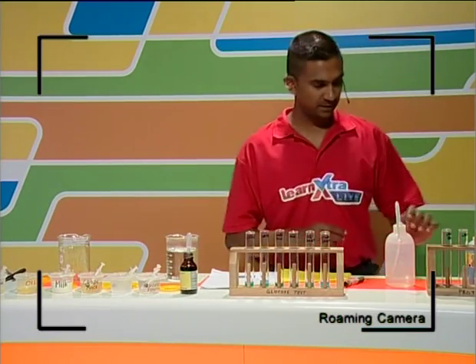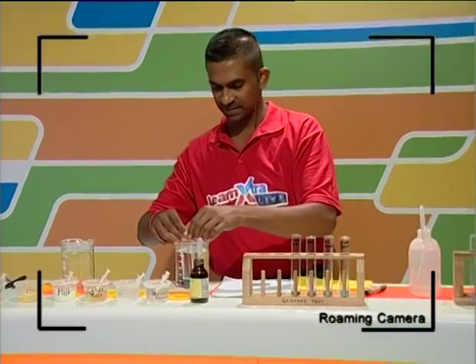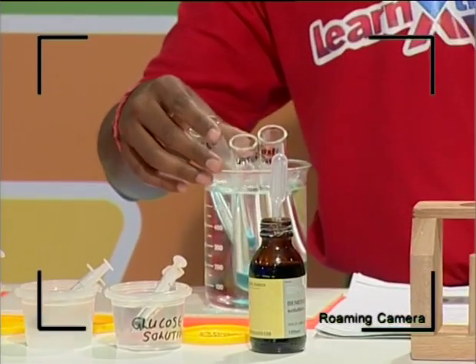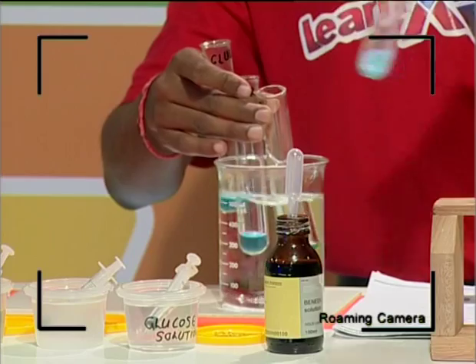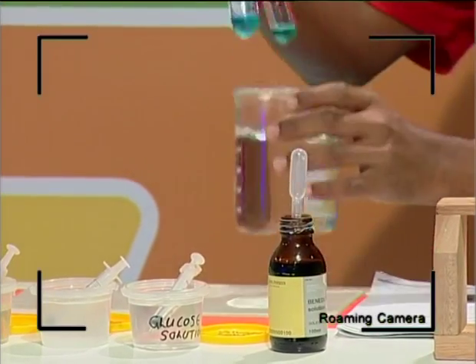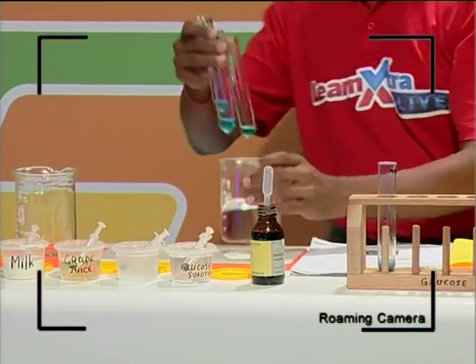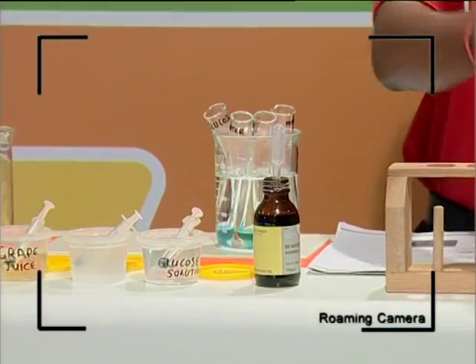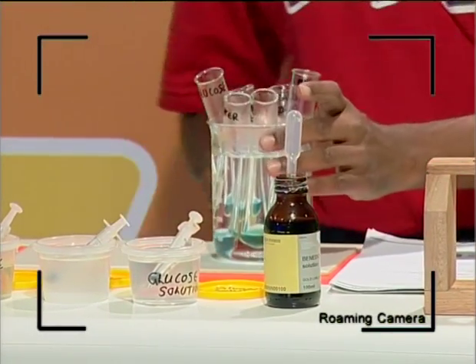Remember that dangers, accidents can always happen, and you've got to be very careful. We normally will use a water bath at school, but I know that we all may not have a water bath. There's a bit too much water in here, so I'm going to drop out a bit. Okay, we just need a wee bit, and obviously that's causing the test tubes to jump up and rise a bit. While this incubates, I'm going to move on to the next experiment.